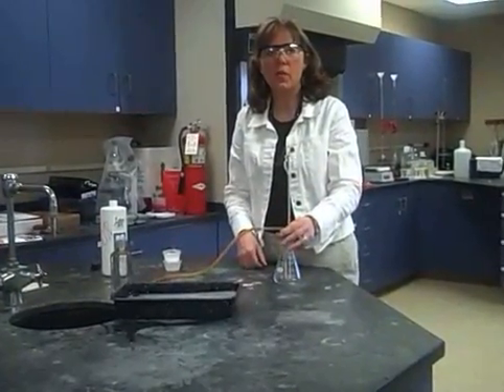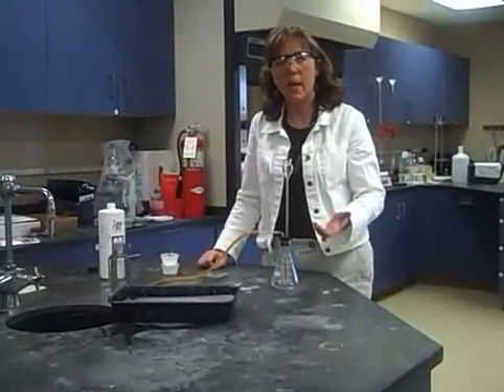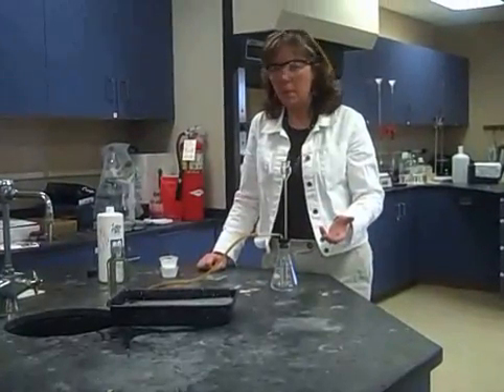Hi, this is Janice Crowley with Wichita Collegiate School. We're going to go over how to collect a gas by water displacement. This is the one in which we're going to be collecting oxygen.